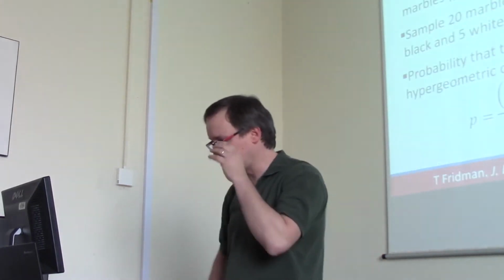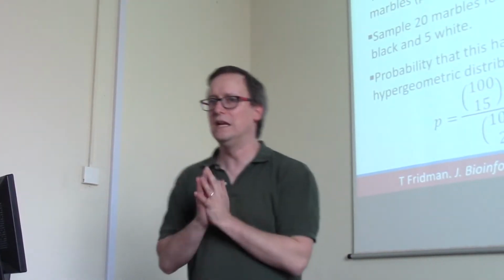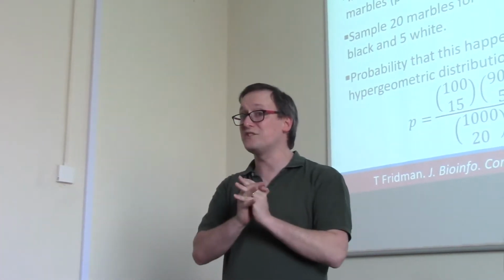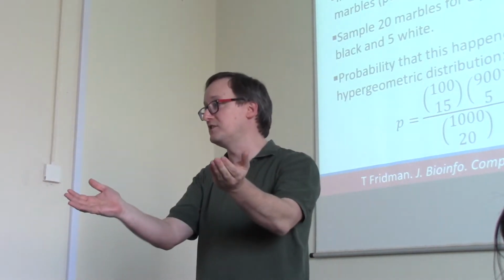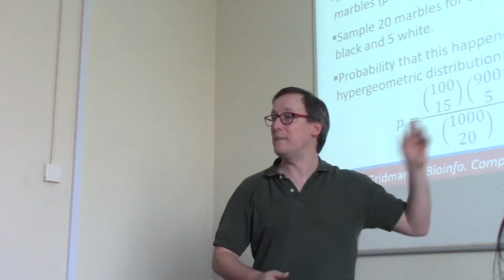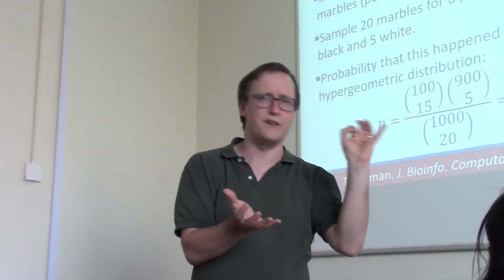No one's perfect. Now, at this point, I would love to pull out the big jar of marbles that I keep in my office for just this discussion, but for now, we'll just imagine we have marbles instead. Statisticians have also taken a look at this question of how you evaluate whether these peaks you've predicted for a sequence are a good explanation for the spectrum. And so you can imagine that the spectrum is no longer a spectrum, now it's a jar of marbles. Each marble has a mass to charge value written on it.